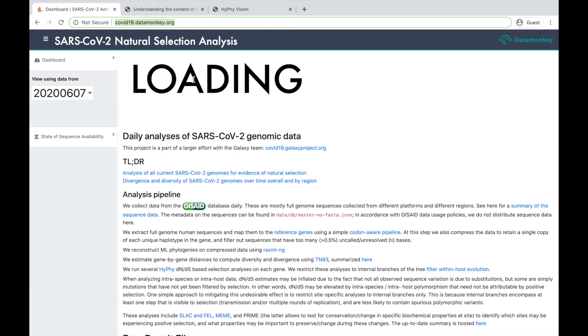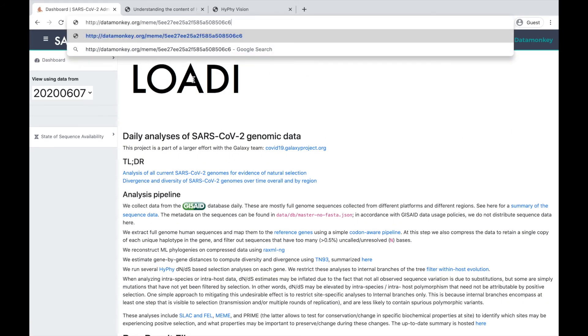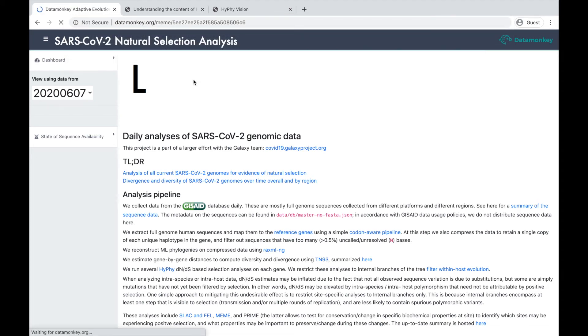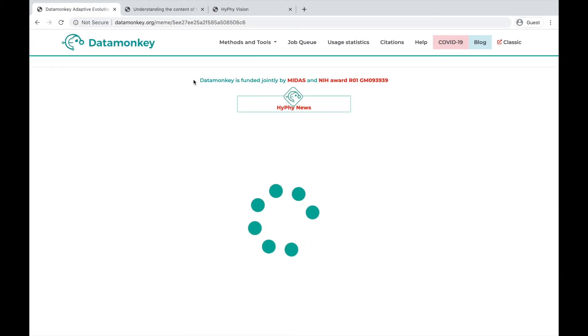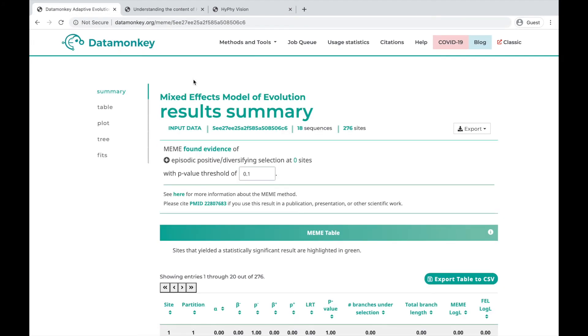And here, using the URL we copied earlier, we can navigate back to the meme analysis that we started at the beginning of the video to see the results.